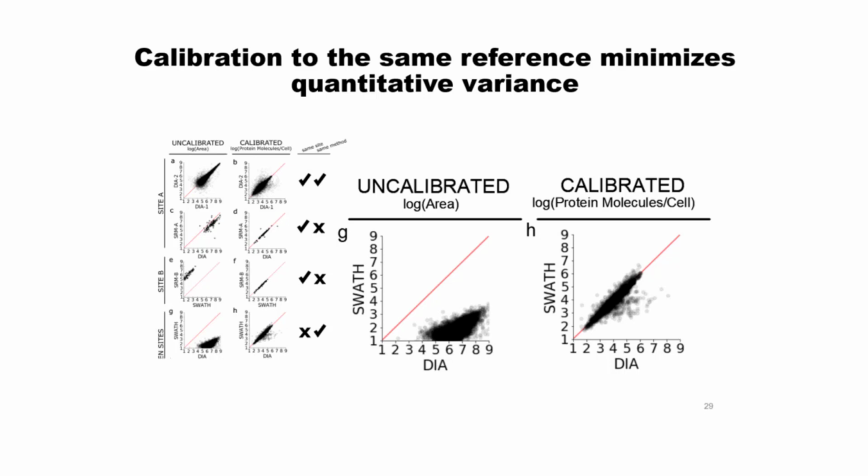It would maybe be better if you had a multi-point calibrator, so we could make dilutions of this and then use that, but we're using a single point calibrator. But the only things we can quantify across labs are things that are found in the sample. That's correct. So it needs to be the full proteome in the full proteome's matrix. Yep.